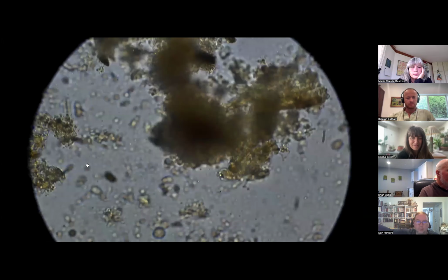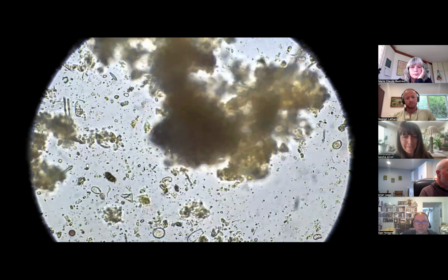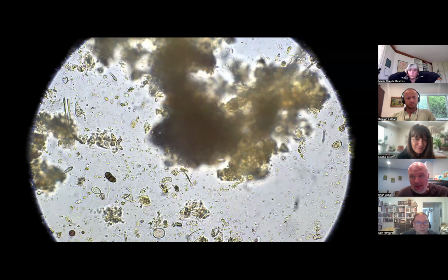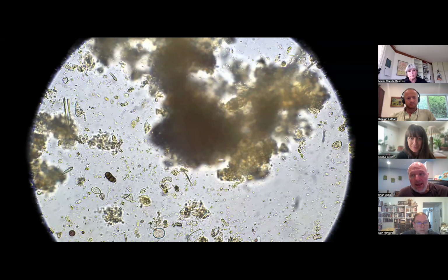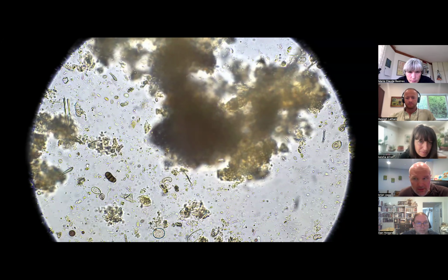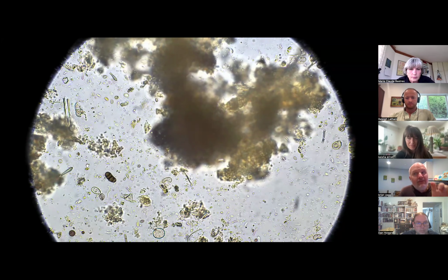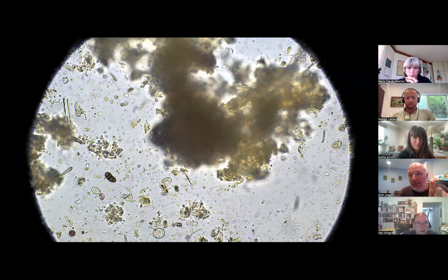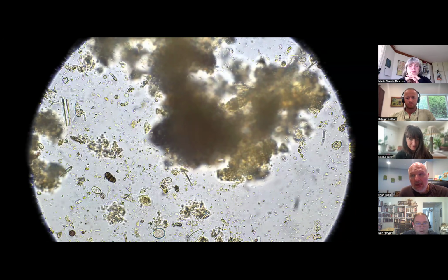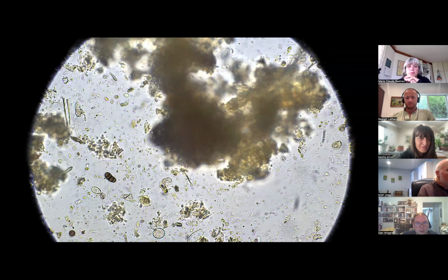Here we go. Okay, so context on this one: I haven't shown it to you yet, but I have vermicompost, so I have worm bins that I use, and we did a microscope session two or three weeks ago, and I left that dilution sitting in the test tube for two to three weeks, and it definitely went anaerobic.